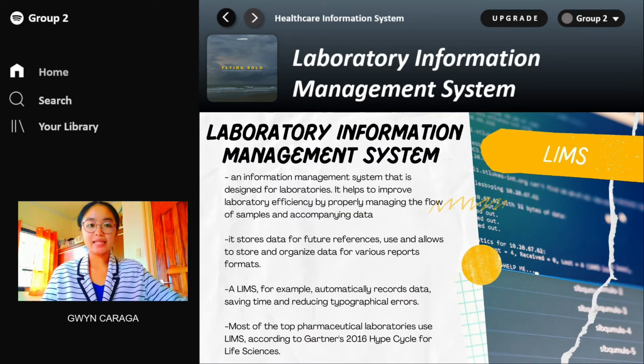So first, let us define LIMS, or Laboratory Information Management System. What is it all about? It is an information management system that is designed for laboratories. It helps to improve laboratory efficiency by properly managing the flow of samples and accompanying data. It also stores data for future reference.